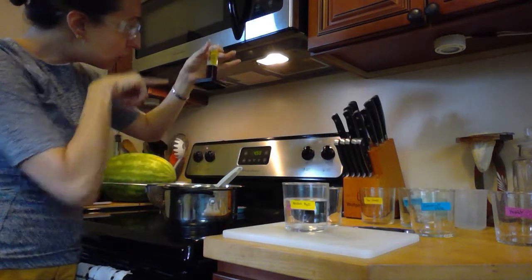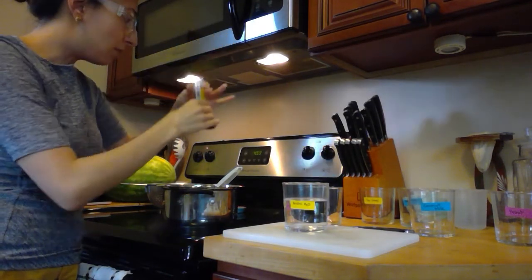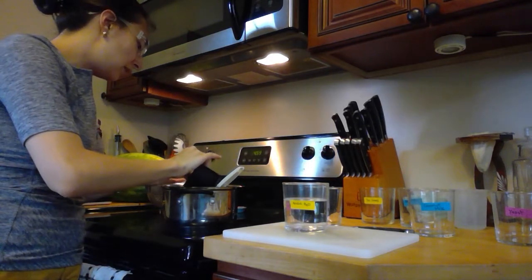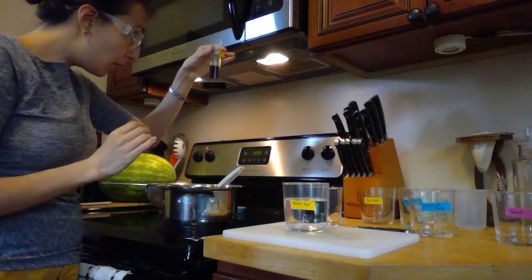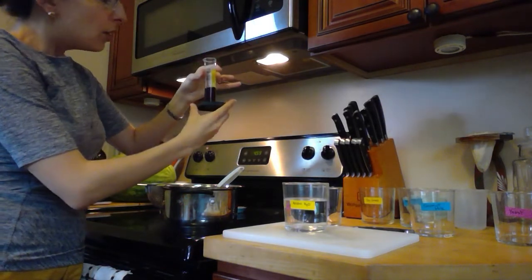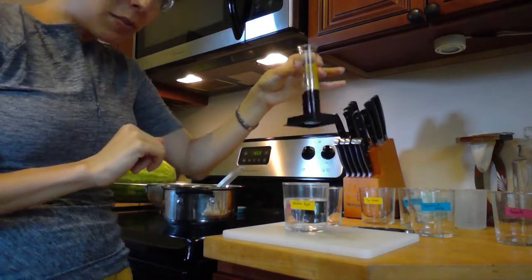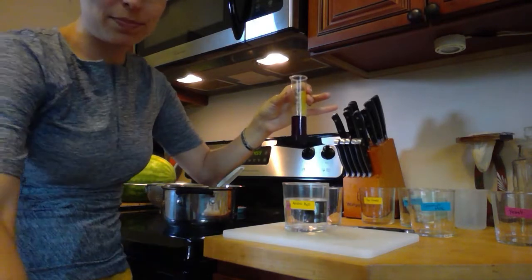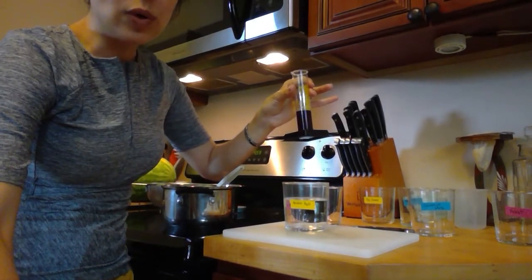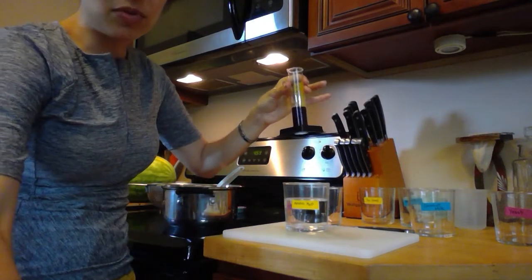So I'm going to look straight on exactly at it and make sure that I am right at my 25 milliliter mark. I need to get just a tiny bit out. And there we go. So you're eyeballing to get exactly to that 25 milliliter mark. And if you have that meniscus, you take the measurement from the bottom. So now I have this measured out. I have my sample in its cup ready to go.